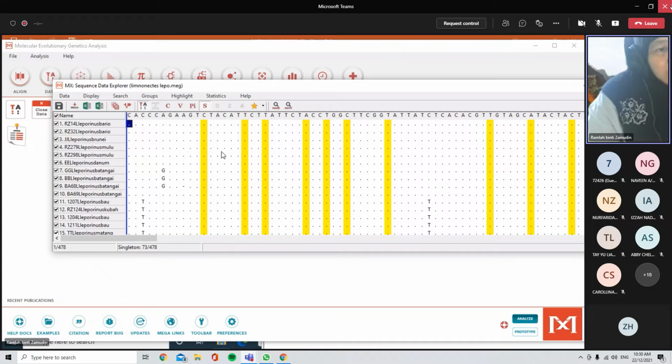So it can be calculated in the software as 74. So when you have this kind of data set with enough variation, you can conclude that the CO1 is a good marker to infer the species relationship, because we're looking at the population relationship of one particular species. Okay, so that is why.